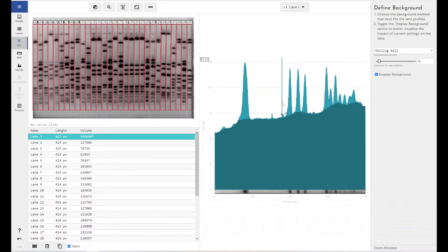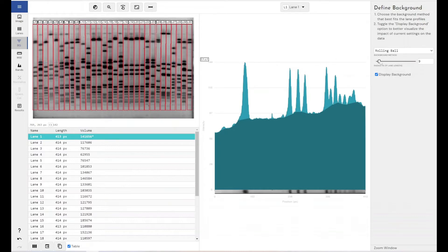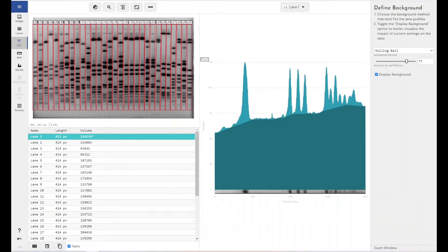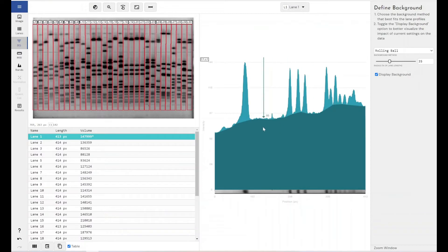Now, all of the background removal techniques within Phoretics 1D you can preview before you make a decision and as you change the settings for that background removal technique. So as you can see, as I change the radius of the ball in the rolling ball background algorithm, you can see it changes what is going to be removed from my lane profile and what is going to be counted as background.